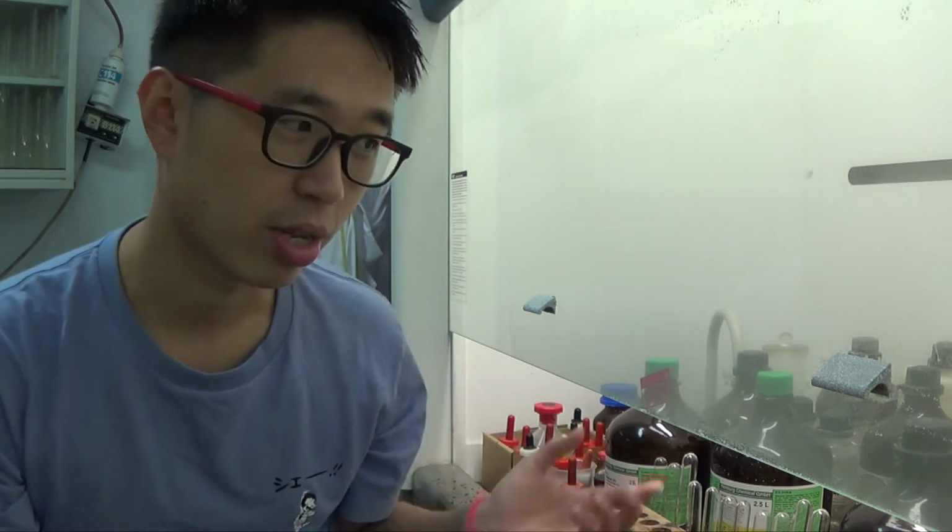So copper metal reacts with concentrated nitric acid. There is quite an important case study. You will have seen it somewhere along the line when you were doing O-level or IGCSE, because the balanced equation is actually quite tricky, but the reaction is spectacular because it does not give you the usual metal plus acid giving you hydrogen. No, it doesn't. Instead, with concentrated nitric acid, copper metal will give you NO2 gas. NO2 gas is nitrogen dioxide and is brown in color.